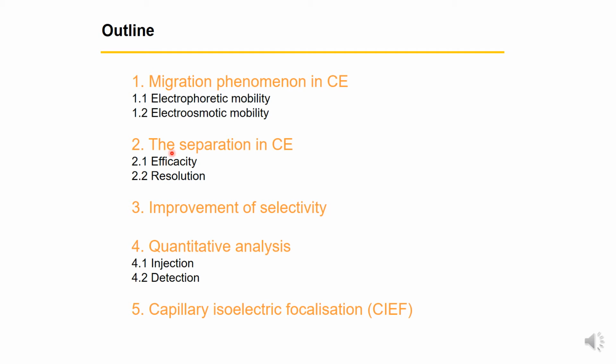Then the separation in CE, especially the efficacy and the resolution, and a big part on the improvement of selectivity. Of course, this is a part on the optimization of the separation, and then the selectivity of the separation. And I will speak about some detectors, but not on capillary isoelectric focusing.